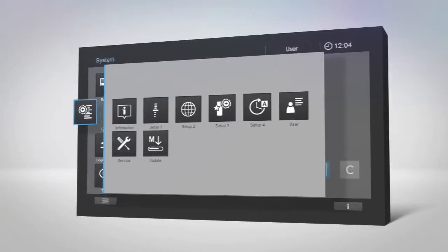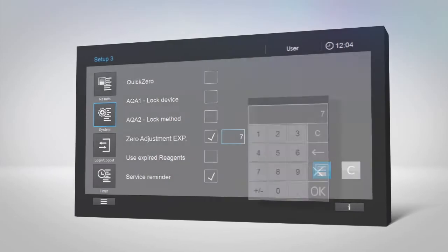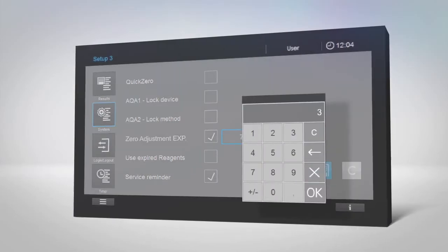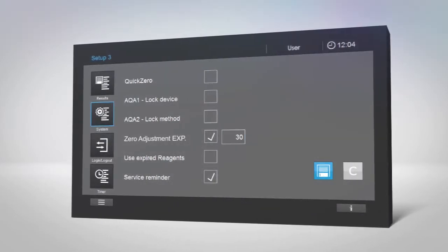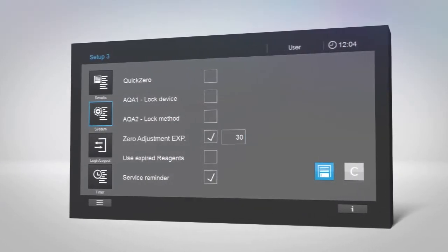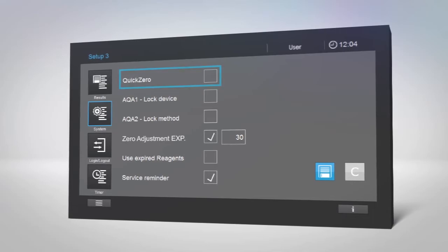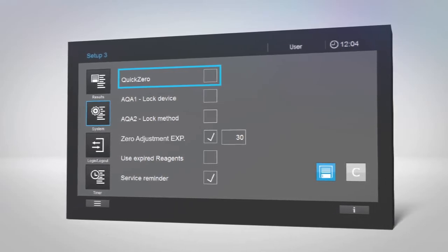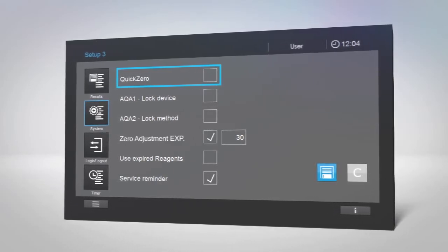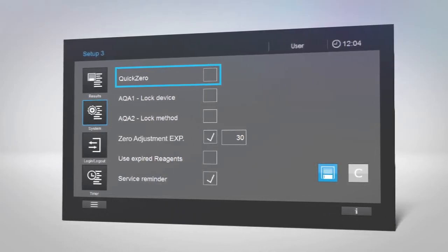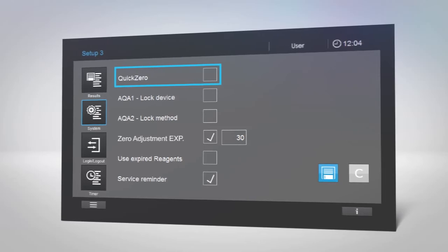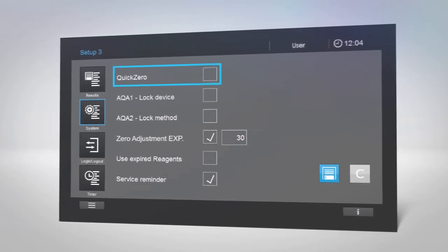In setup 3, the expiration time of the zero adjustment value can be entered manually. If you use various SpectraQuant test kits, the quick zero function will help you speed things up. It allows you to perform zero adjustment for every wavelength used in the methods of our test kits with a single touch.